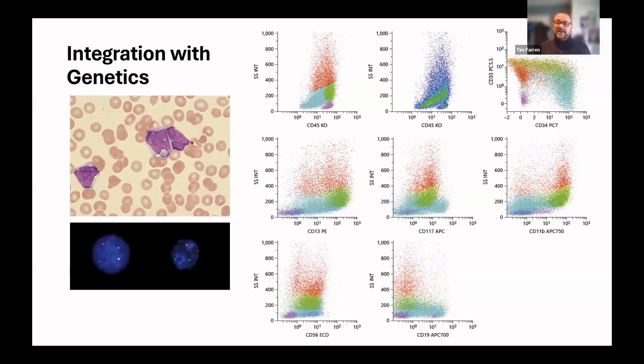So it's really important that you have a good panel that will differentiate your cells of interest. Then we've got the cells that are in this cyan color, which are the blast cells, and we've got magenta for the lymphocytes. And you can see here that the leukemic cells express this phenotype that has a high intensity of CD34. We've got CD13, HLA-DR, and MPO with a weak CD33 expression. You may also see here that we've got some aberrant expression of some lineage markers. We've got CD19 and CD56 positivity on the myeloblasts, and we can see some CD56 on the maturing neutrophils.